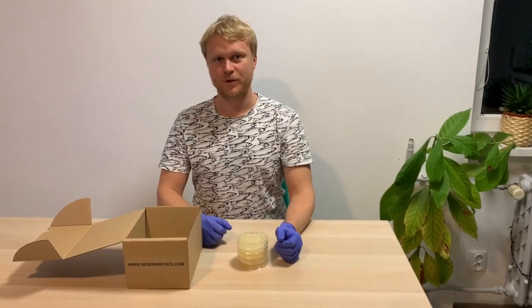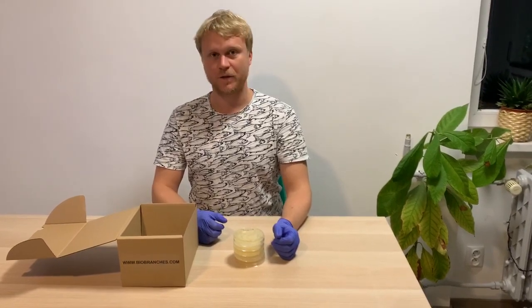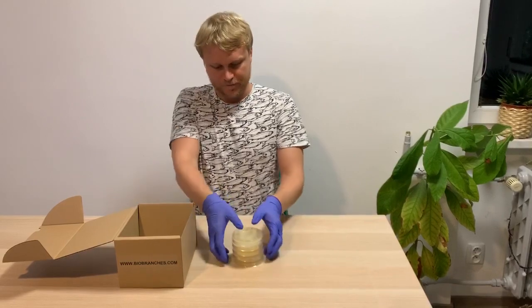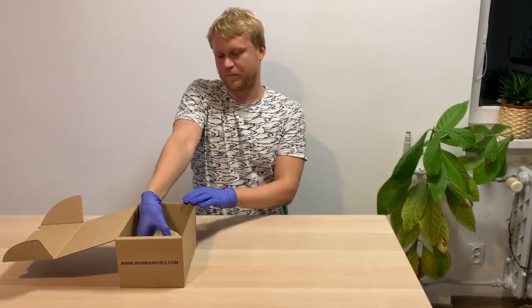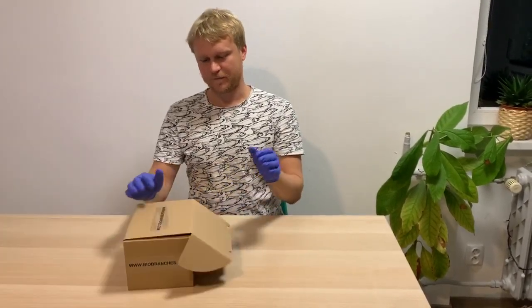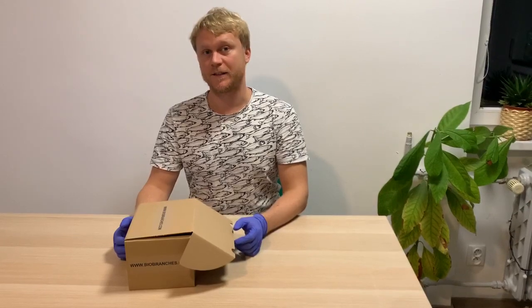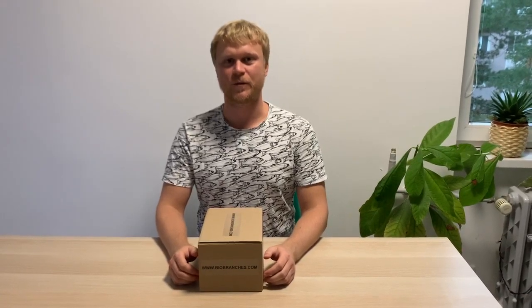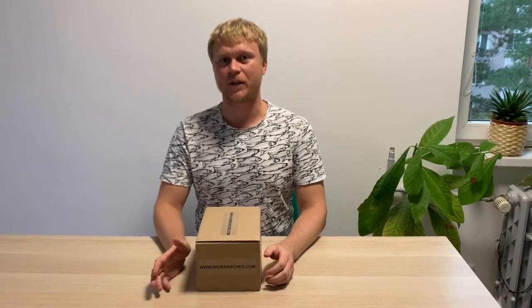Sampling is done. Put your petri dishes upside down into a warm, dark place — for example, in the provided box. Wait three to four days. After several days, bacteria will have divided and multiplied on the agar plates. Thus, it will be possible to identify the different colonies.